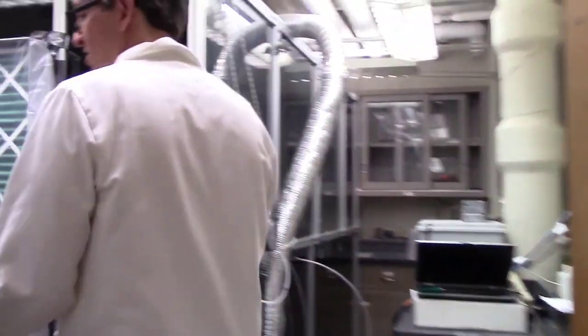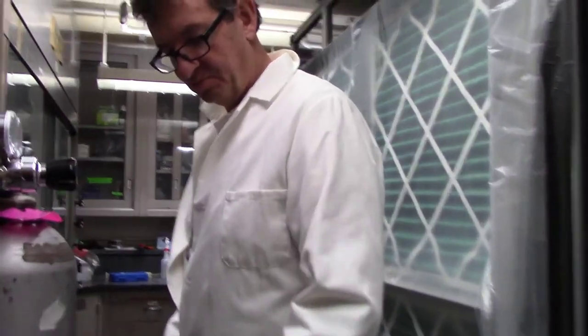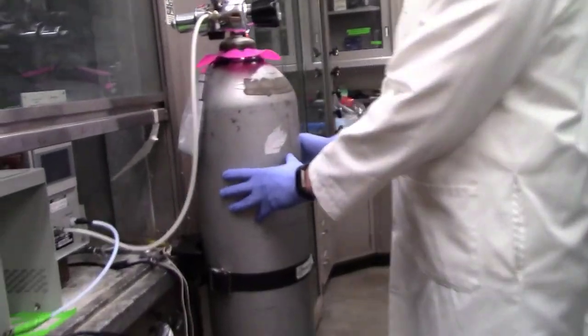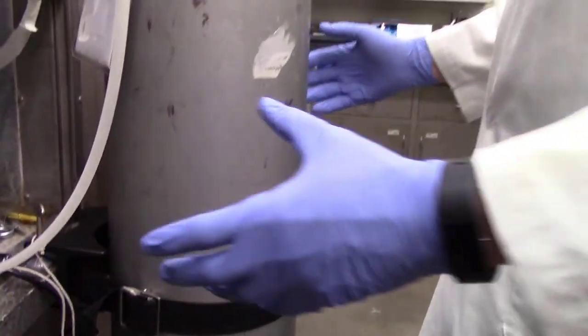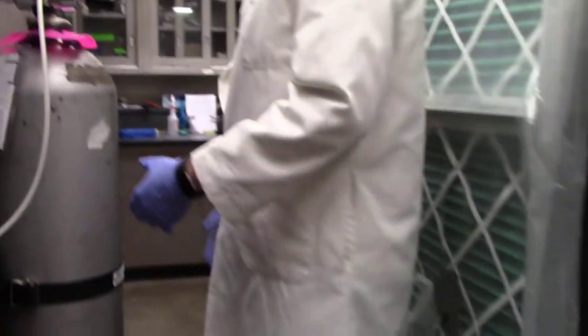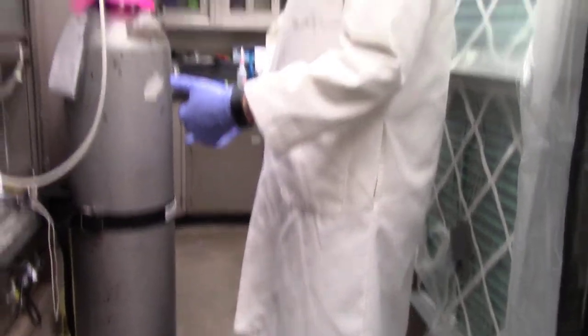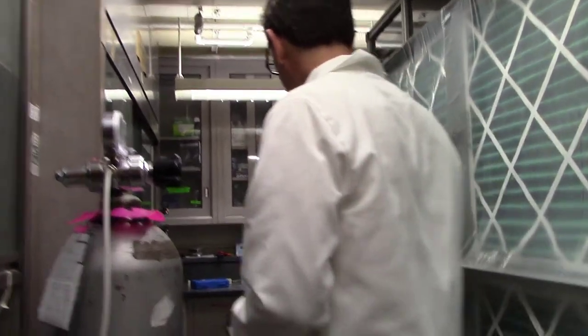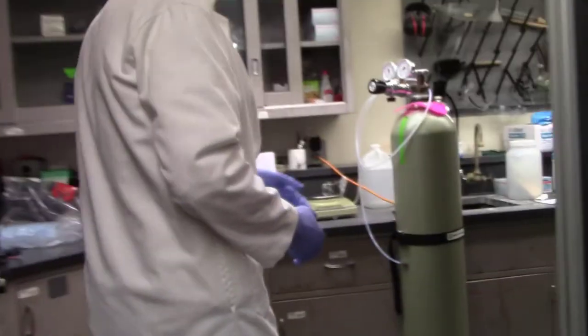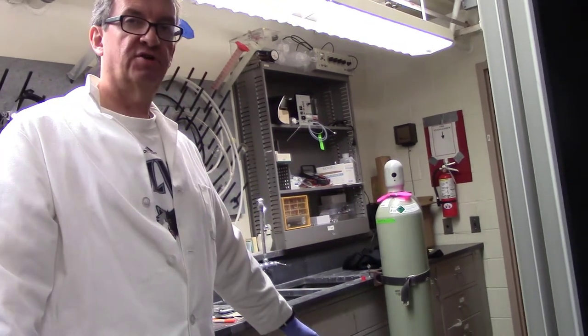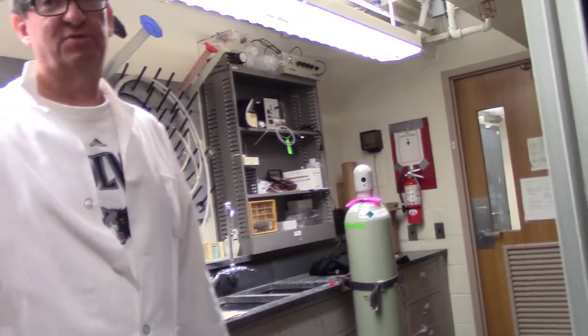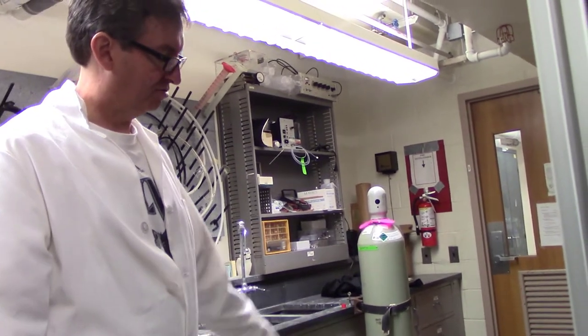So one hazard that we have in this space is this gas cylinder which is properly attached to the bench here, but it creates a very narrow walkway so it makes it hard if there's an emergency to exit. There's also another spot along the floor here where there's a cord going across from the electrical outlets to this chamber, and we have properly put a cover over the cord and attached it to the ground, but that is another potential hazard for tripping if you're walking through the space.